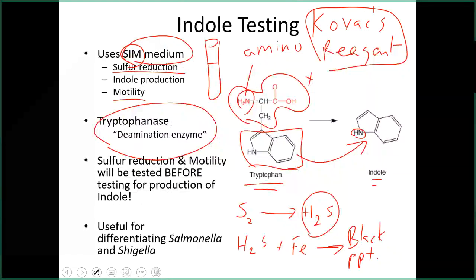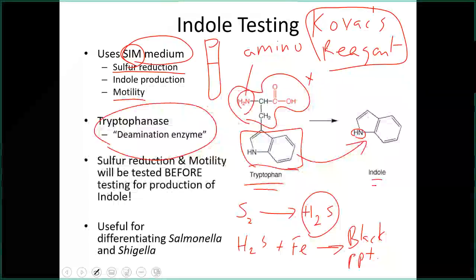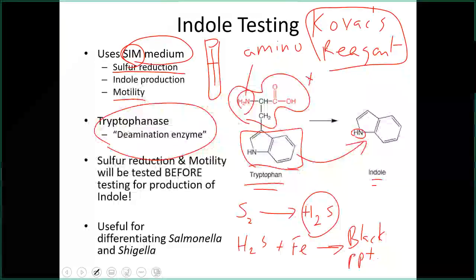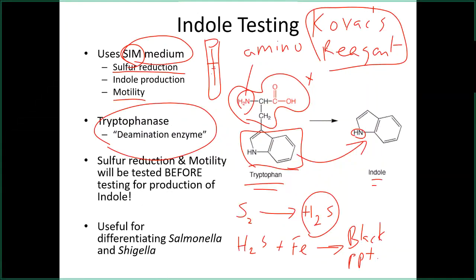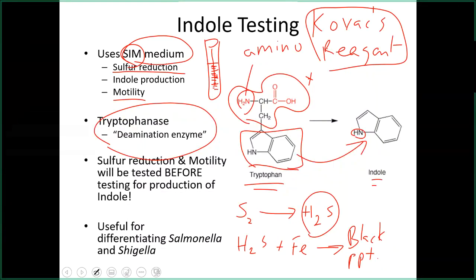In other words, it's been straightened. There's no loop in the end of it. It's just a needle. You stab this needle straight down in there and then pull it out. And the organisms then are left behind. And if they grow, you'll see coming off of that little pore that you formed in here, you'll see growth going out into the surroundings.